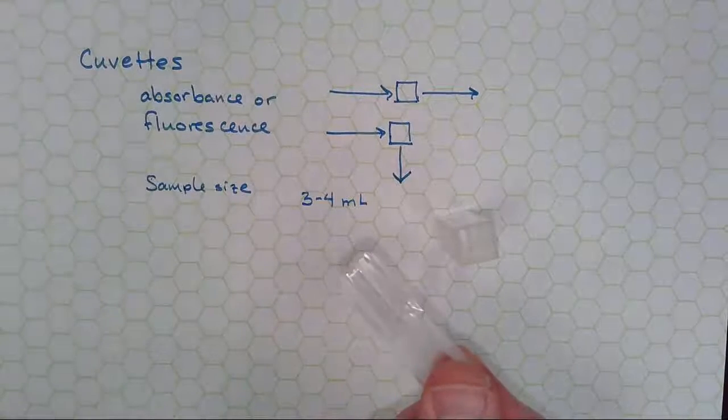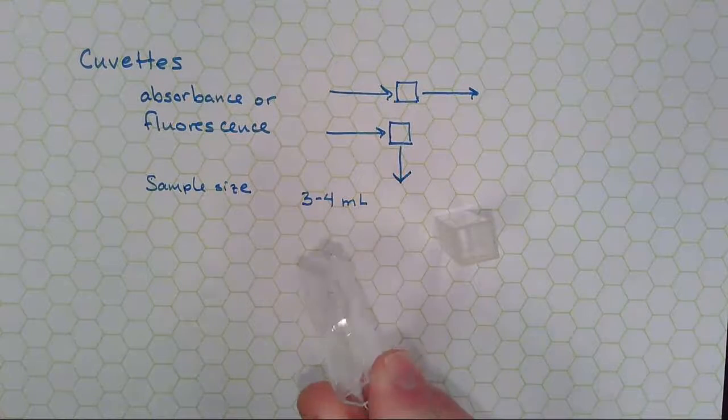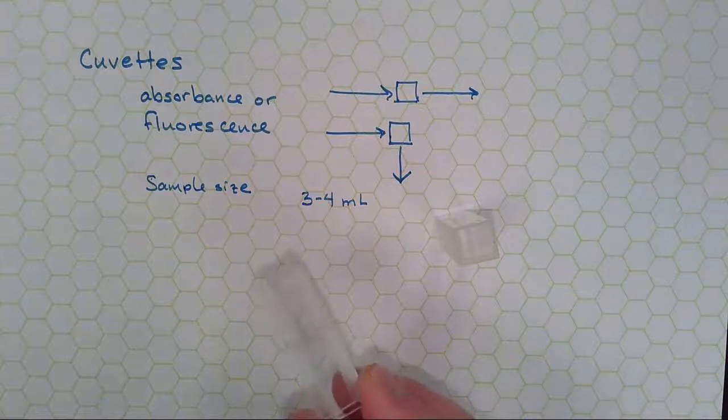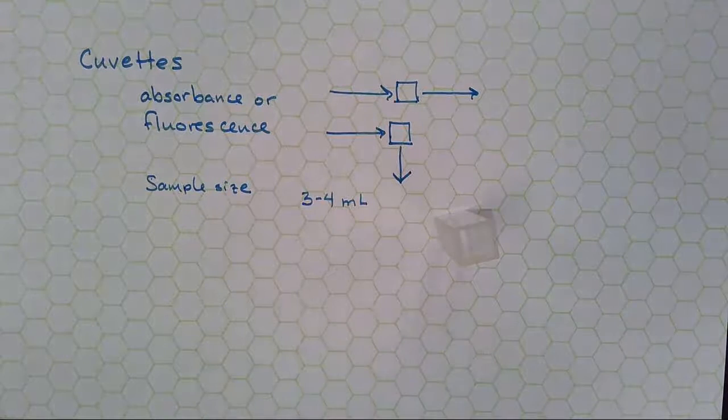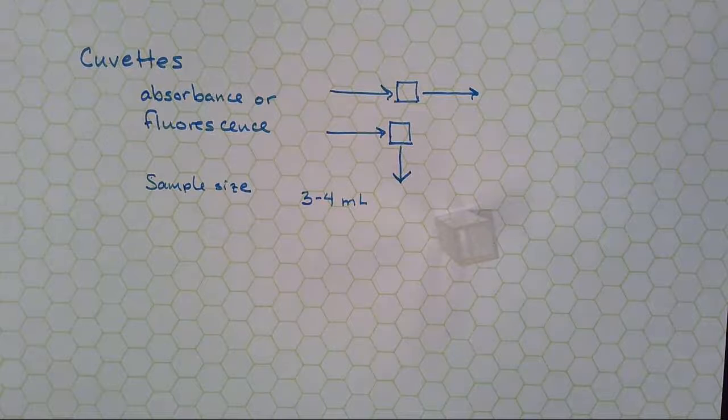This cuvette, which has a narrower bottom, you can get by with half a milliliter or so. I'll pass that around as well.